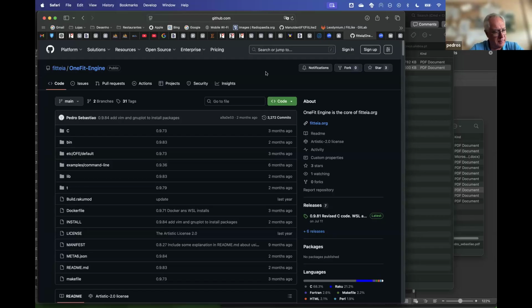If you are going to analyze data on a regular basis, and if the data you are going to analyze is more or less always of the same type, then having a fitting engine on your local computer with either a graphical or text-based interface might optimize and automatize your data analysis and data fitting.